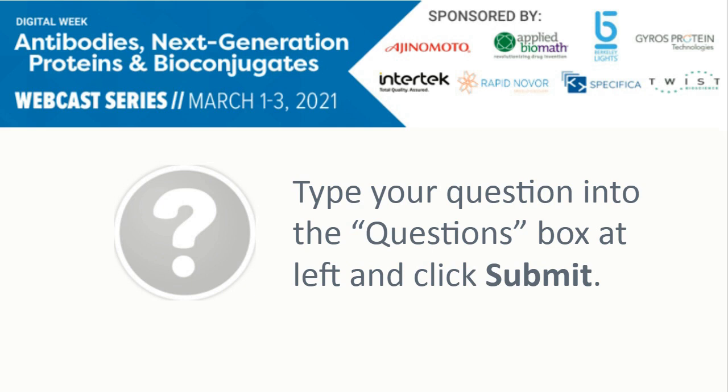And that's something that we're keen to explore. I'm not saying it's a deal breaker for us, but it's something that we're keen to check out and observe, because if these mice are built for diversity and they have an extremely divergent response, that can be problematic from the proteomics perspective. What we're keen to try in the very near future is highly inbred strains, I think, is where we're sitting in terms of our thinking about this.